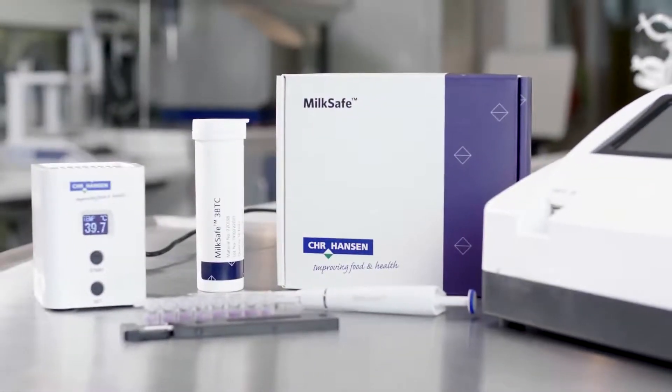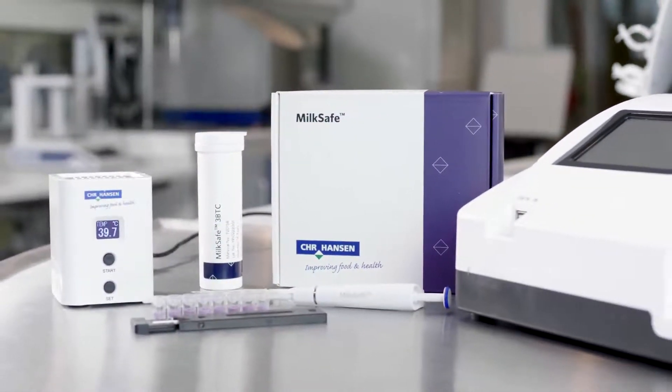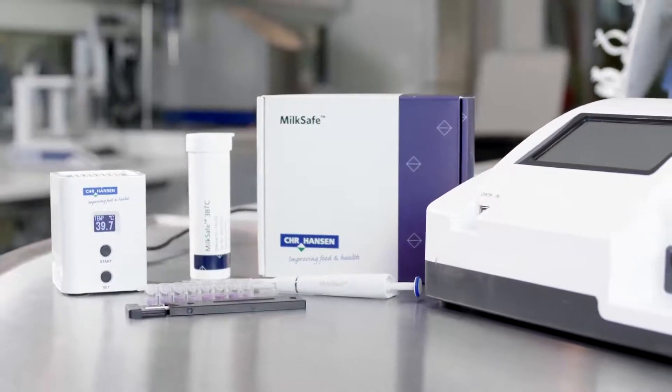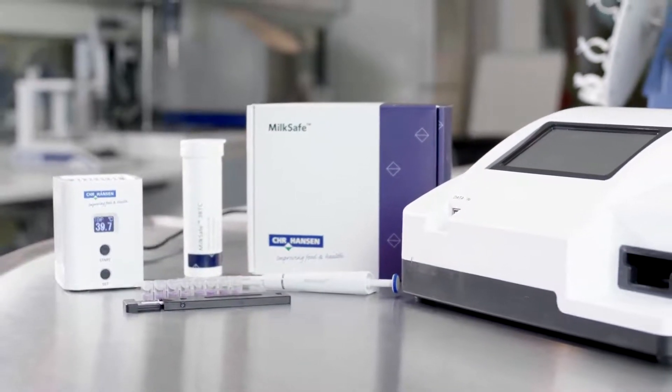To test for antibiotic or aflatoxin residues in milk, you will need the MilkSafe desktop reader, a MilkSafe test kit, and an incubator.